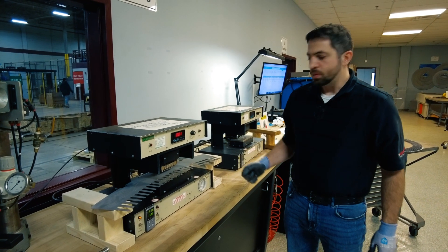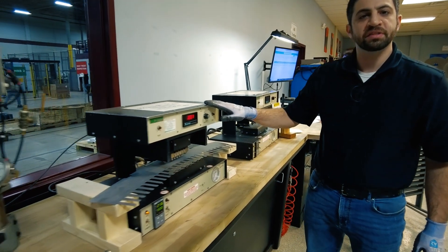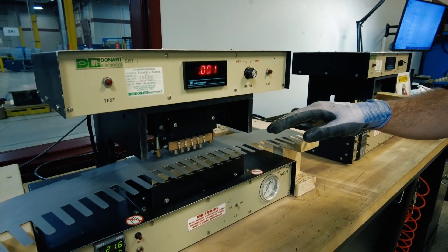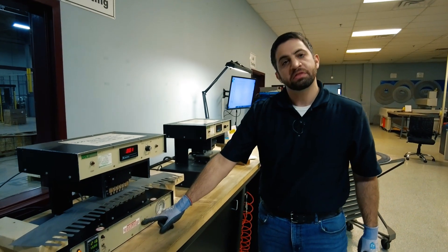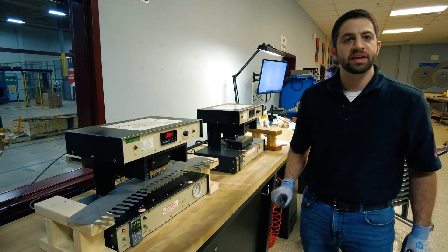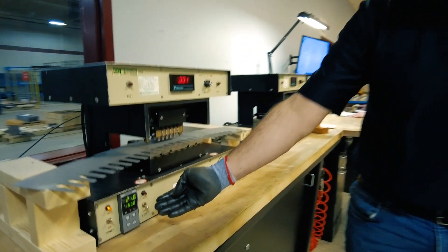This is our Franklin tester. What it will do is pierce through the coating, conduct electricity, and tell us how much resistance the surface of the coating has. We have the ability to run at either 300 psi or 750 psi, all governed through an ASTM specification A717.